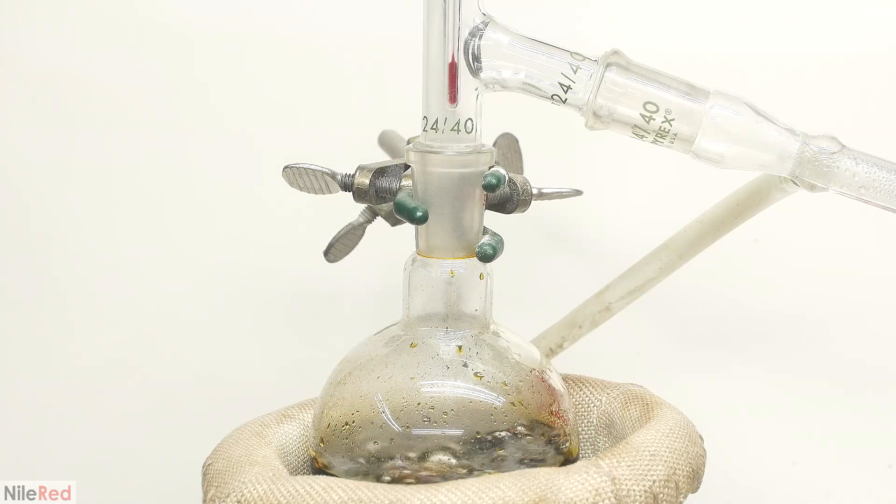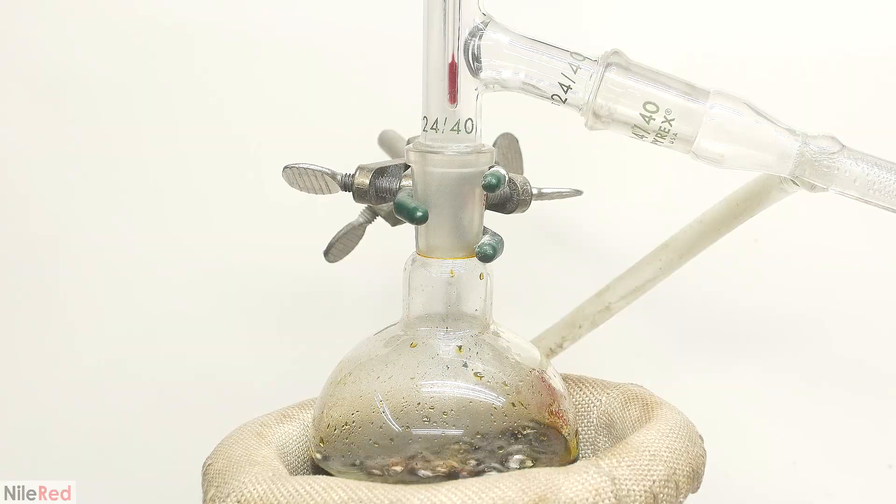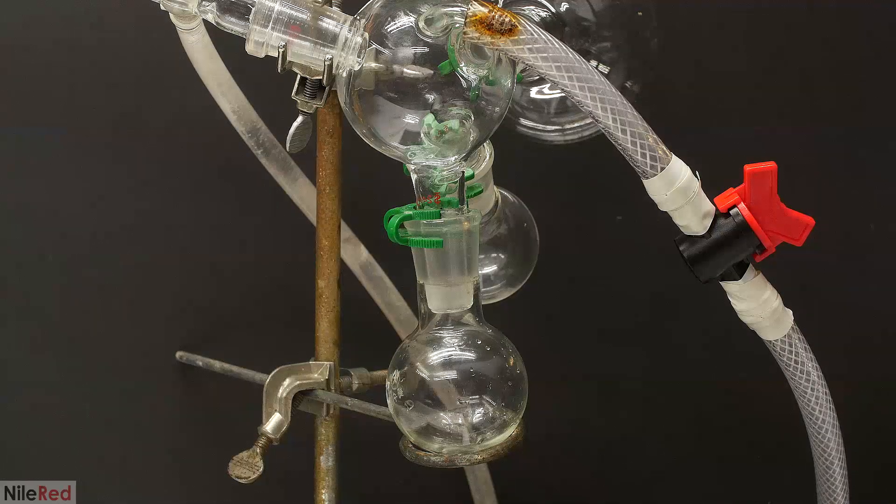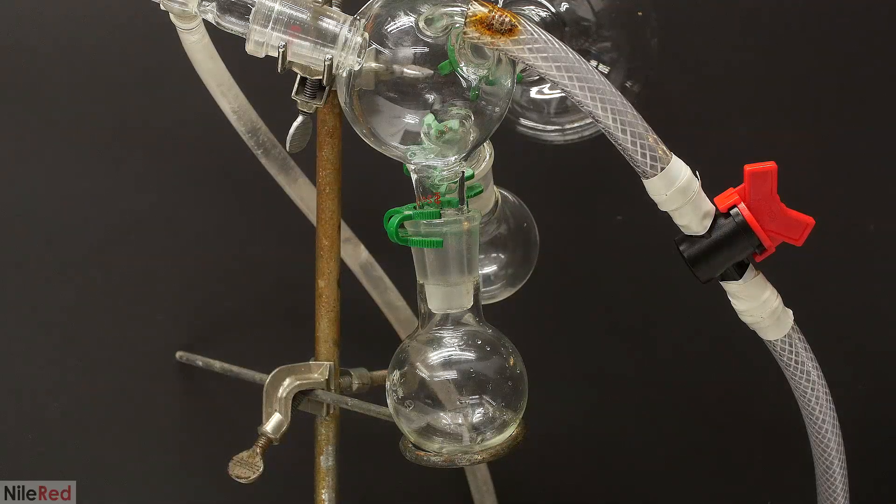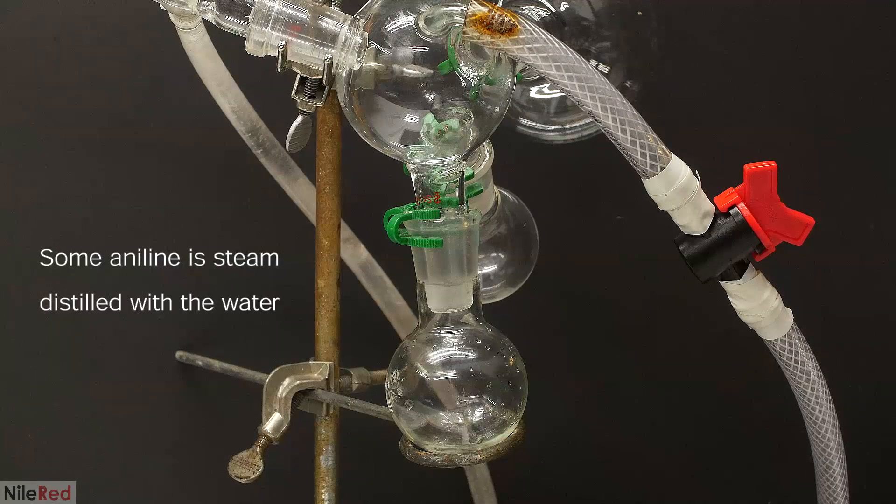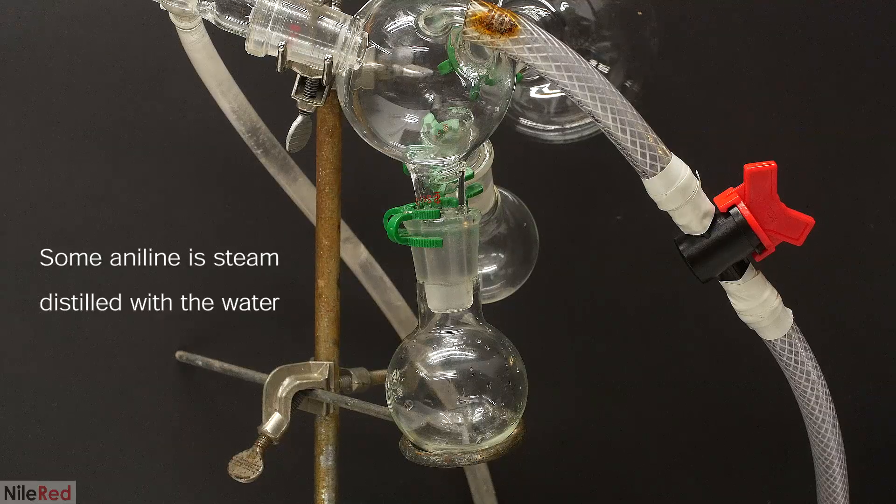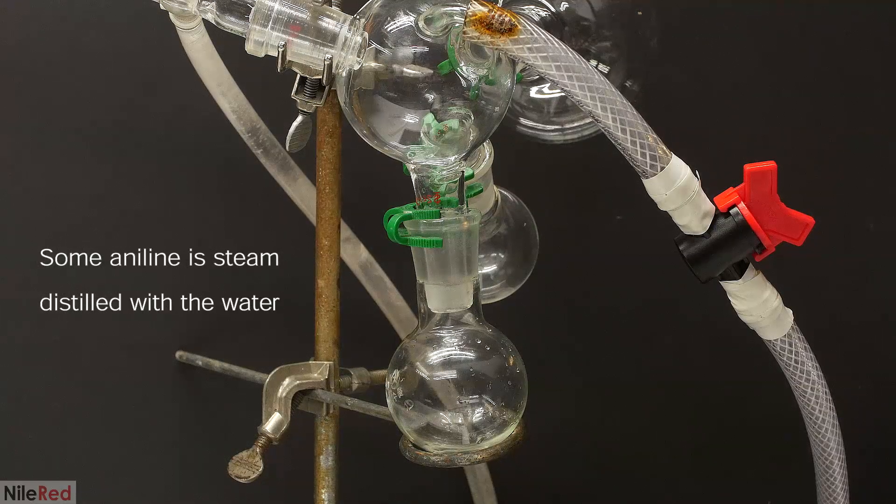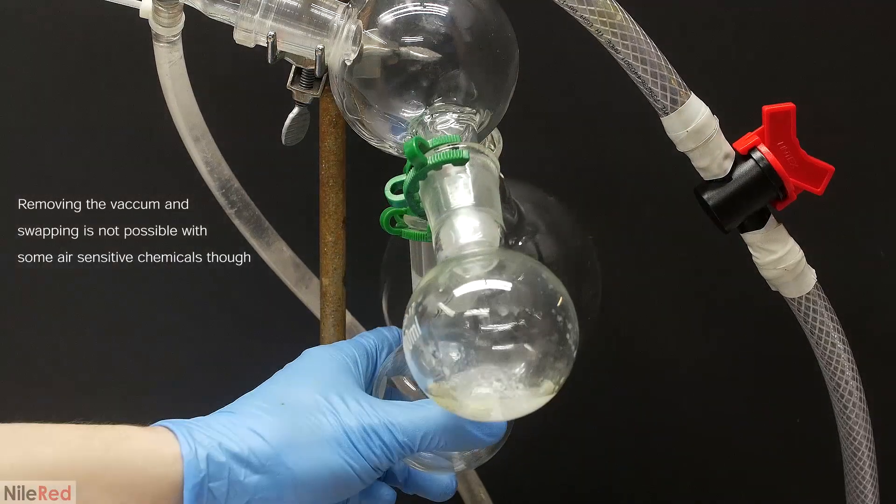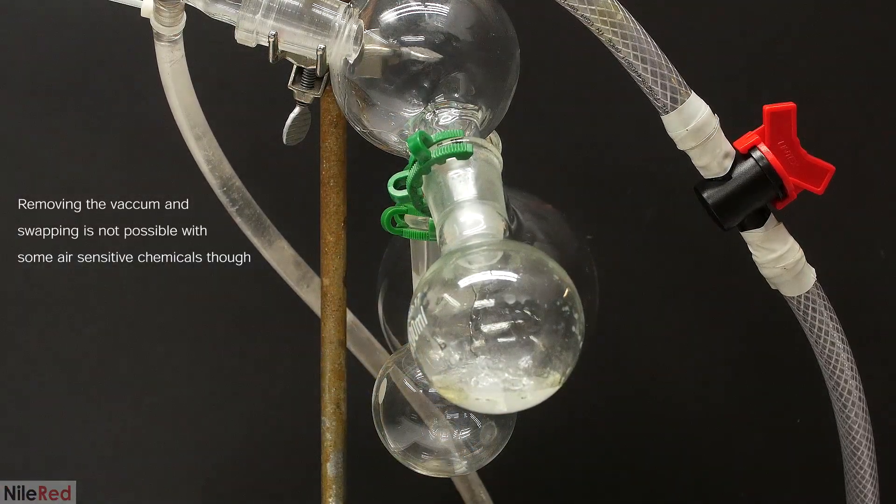I turn on the heating in the vacuum, and the first thing to come off is going to just be water. When we take a look at the other end of the distillation setup, you can see that I'm using my three-way cow adapter. In the beginning, I'm just collecting water, but at some point when the aniline starts to come over, I need to swap out the receiving flask.